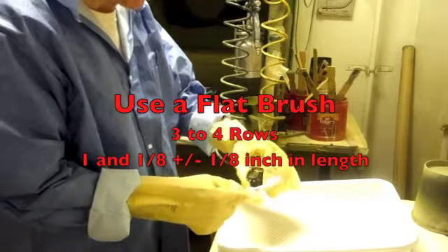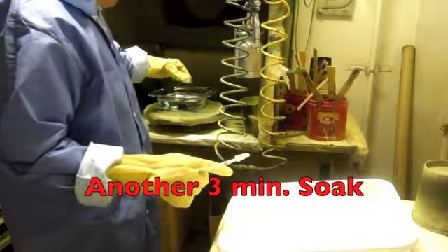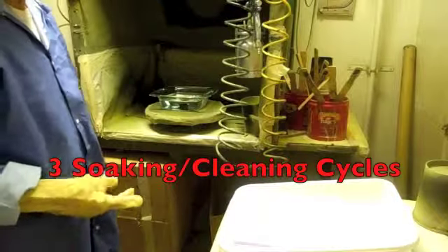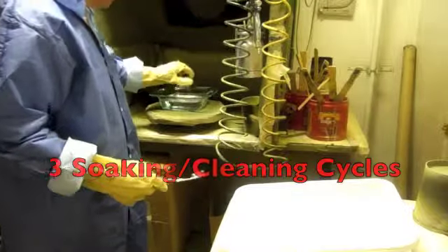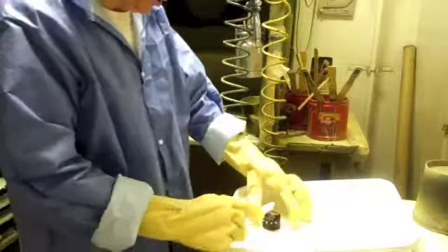It's supposed to be a firm bristle brush. We do that ten times, and then we put it back in for another cycle of three-minute soak. We're coming up on the last cycle for this particular part. Then we wet the brush.